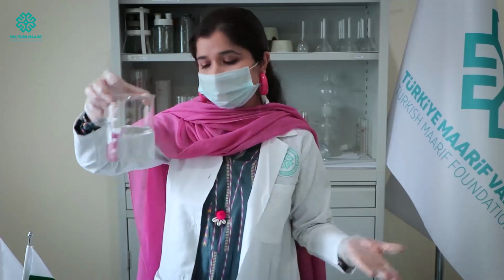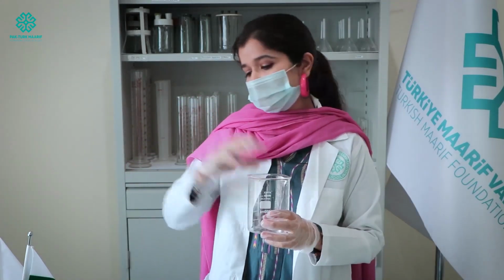Now what is the reason? The tap water was transferred into beaker 1, which is filled with the sodium hydroxide, and simply the tap water becomes alkaline. Yes, because sodium hydroxide is a base and you are making the water basic in nature.